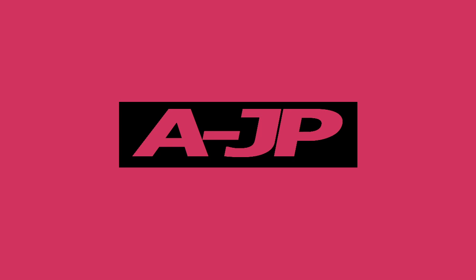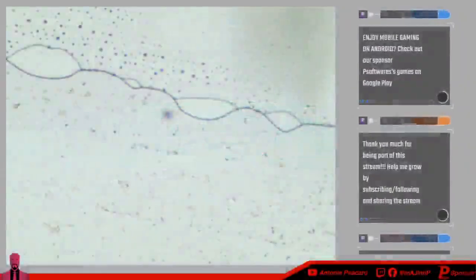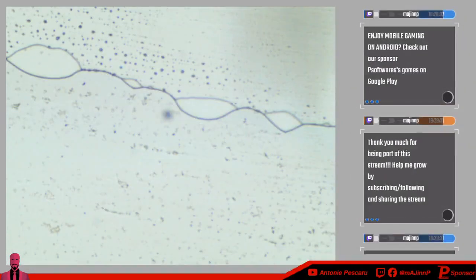These are pre-prepared slides, by the way, that I made sure to prepare in order to view. Let's put it back, and let's go back to some buccal cell hunting.